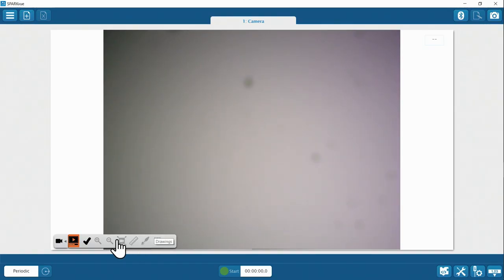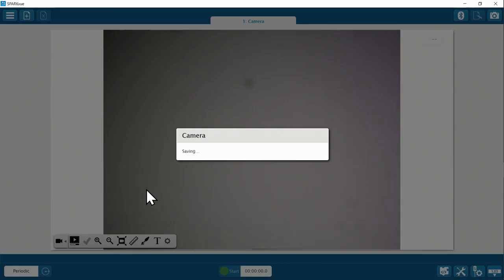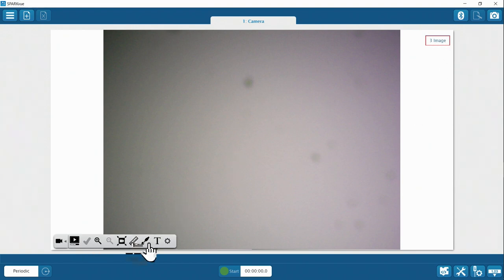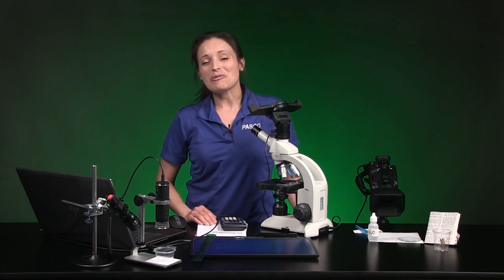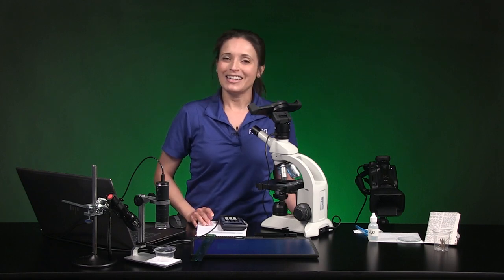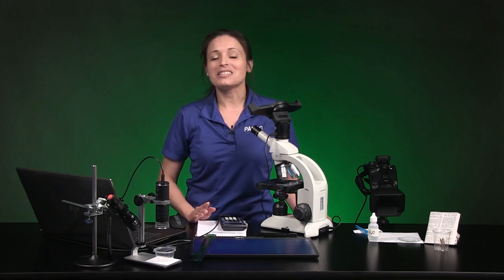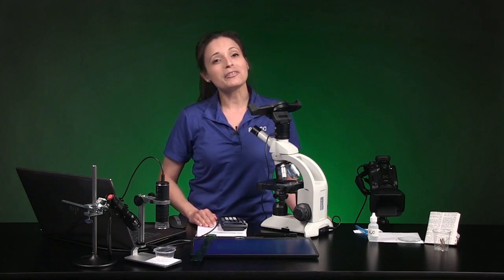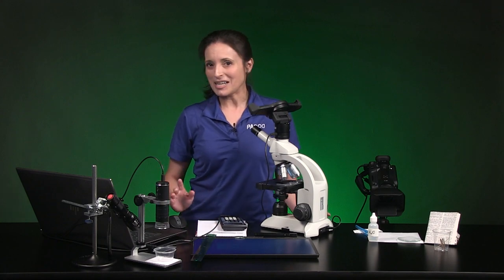Another tip: you might notice a lot of the icons in the camera tools menu are grayed out and unavailable sometimes. The live feed has to be turned off and at least one snapshot has to be captured to make these icons available. Now we're ready for part two where you'll learn how to prepare a dry mount slide. Before we move on, let's save our work. Your teacher may or may not ask you to save your work in SparkView, but it's never a bad idea to back up your work.